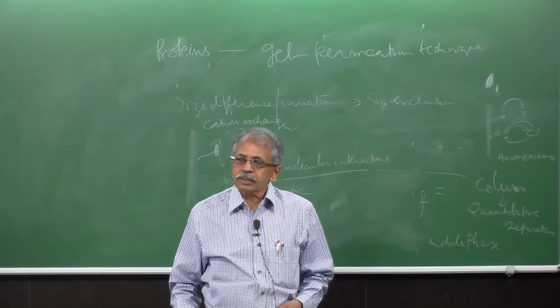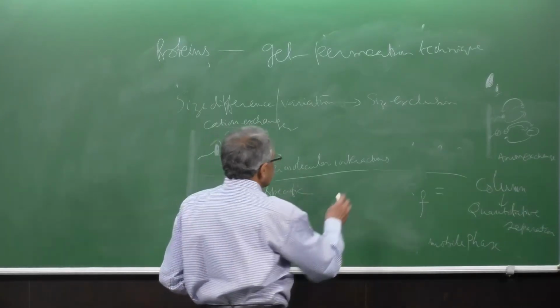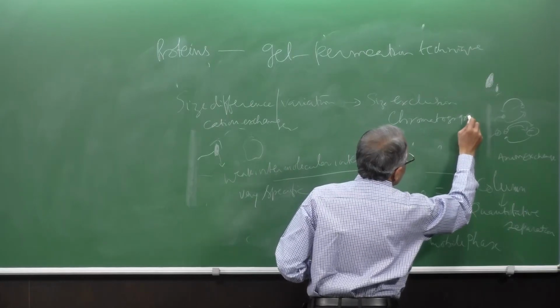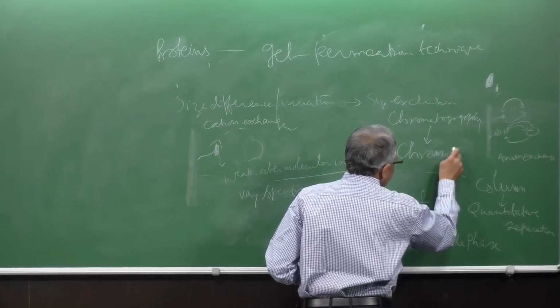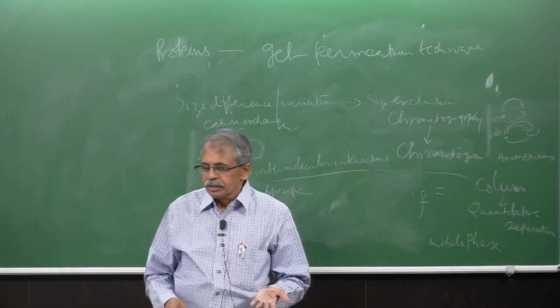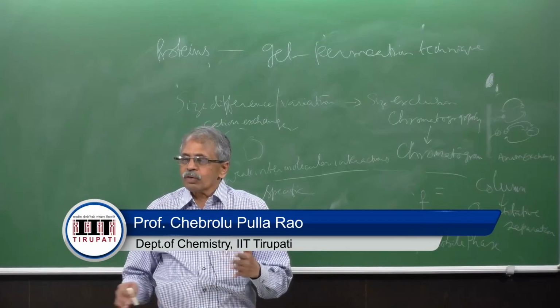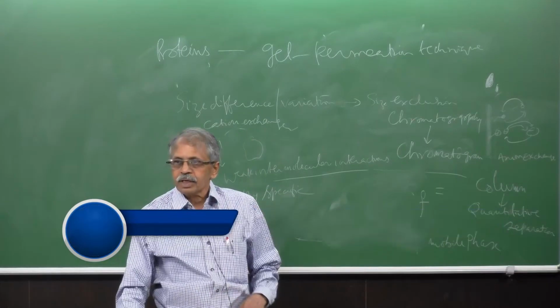In the next class, I will show you some chromatograms. Chromatography is a technique. The chromatogram is the one which you collect using the response. The response versus time, response versus volume, response versus rate of flow, and this graph is called the chromatogram. I will explain all of these in the next class.